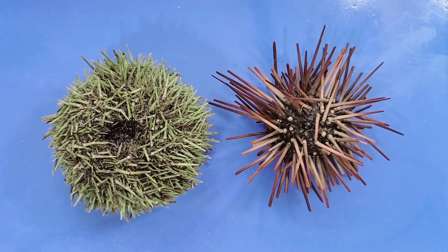I actually have two types of sea urchins here. This one is a green sea urchin, which is usually harvested from the Atlantic Ocean, and this one is a purple sea urchin, which is usually harvested from the Pacific Ocean. A morphological difference between these two is that purple sea urchins have bigger spikes, while green sea urchins have smaller but more numerous spikes.